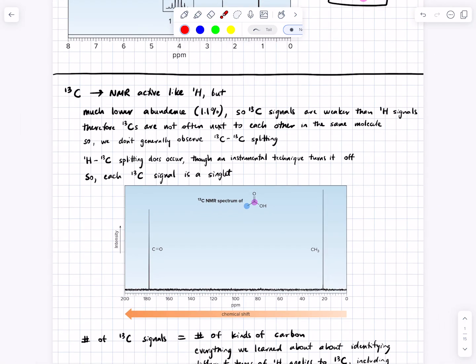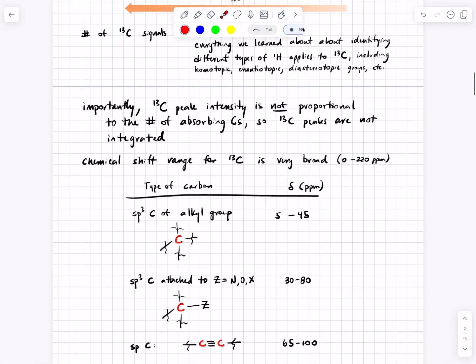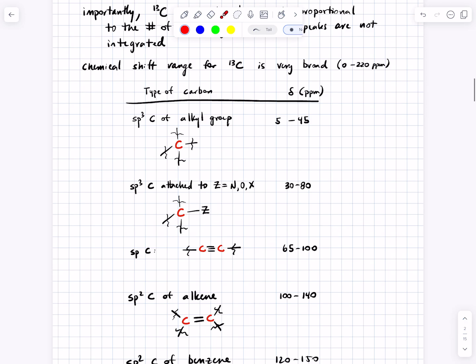I want to show you some C13 chemical shifts. I won't provide a table like this on the exam because, frankly, you won't need it. But it's available in the text, and there will be some problems I think you do in the study guide that'll have you just do some basic interpretation of C13 data.